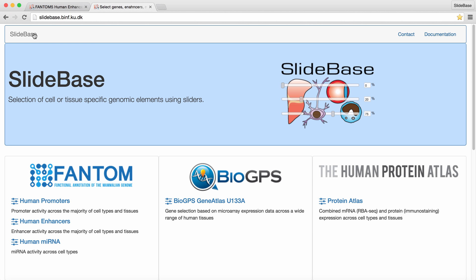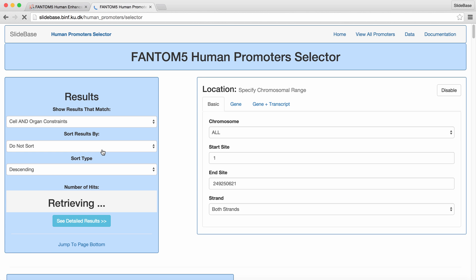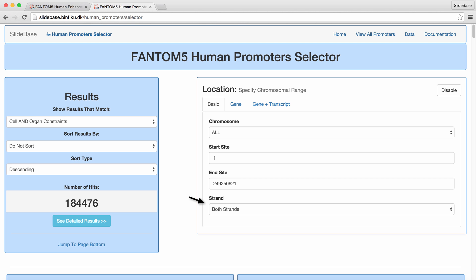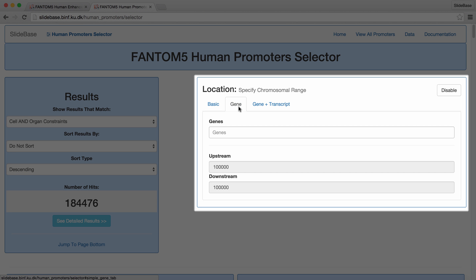From the main Slidebase homepage, we can navigate to the human promoter selector. On the promoter homepage, we click on the human promoter selector. As we can observe, the promoter search page is almost identical to the enhancer one. The only difference is that we can input the strand of the promoters we are interested in, whereas for enhancers we don't have strandedness. In the promoter case, we will search for promoter locations close to known genes.